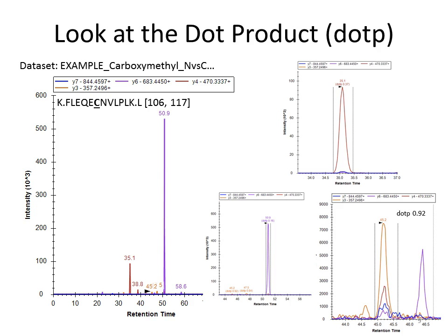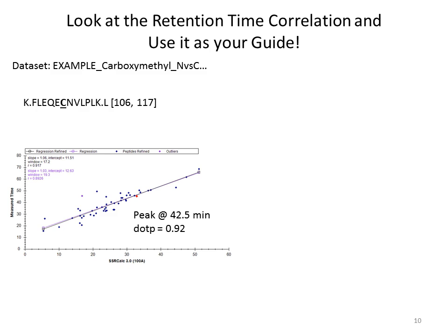I will also say, you have these Skyline files. So this is a data set. I forget which directory it's in, but you can open up the Skyline file, and these data are in there. So during a break, or if we have time, we can walk through. So this is the peptide name. If you do Control F in Skyline, you can search for FLEQ, just like Excel and those other programs. It'll find that peptide, and then you can see some of these examples live. Okay.